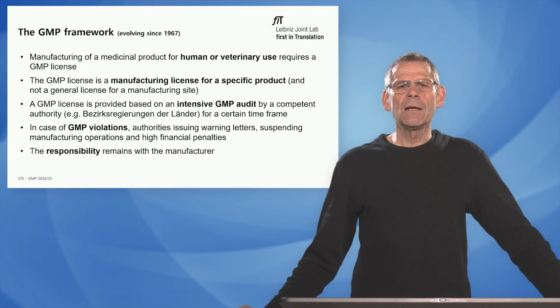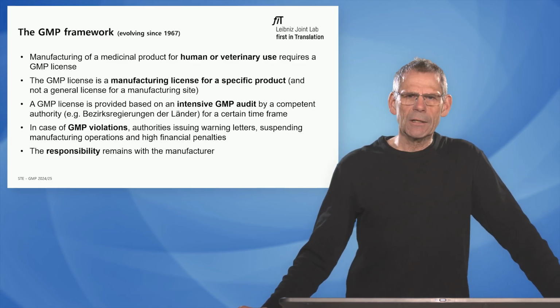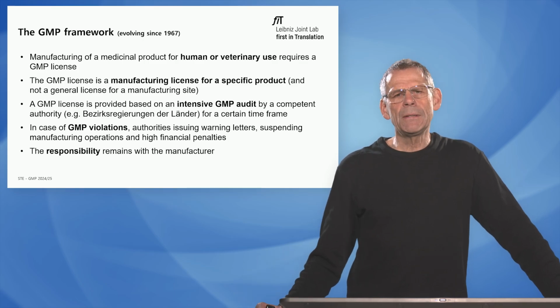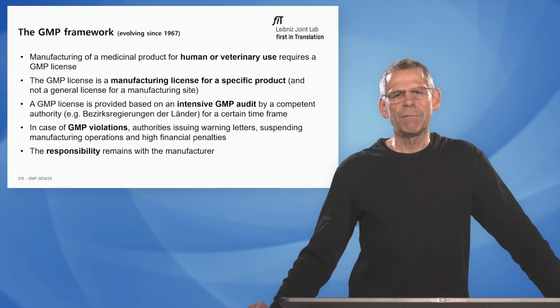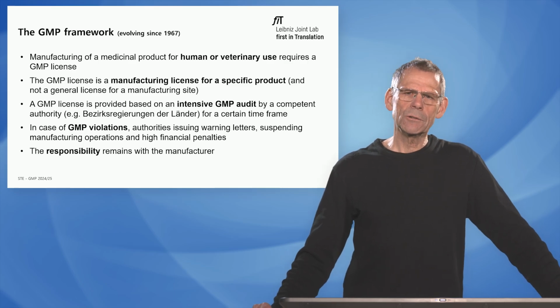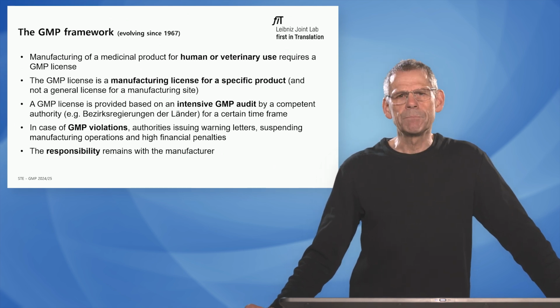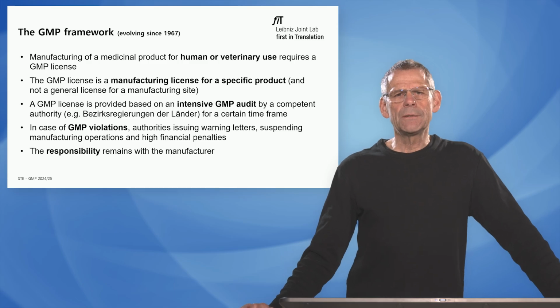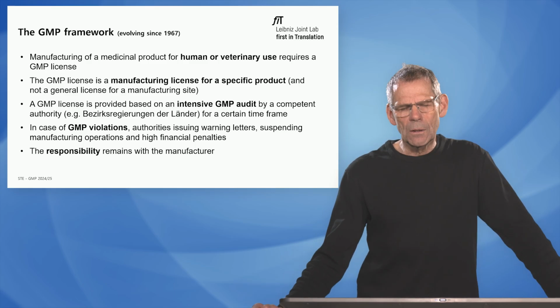And finally, it remains the responsibility of the manufacturer, and not only the manufacturer, but GMP is a top-down approach, which means that you need to have a very strong management endorsement and support to the team to operate according to GMP.